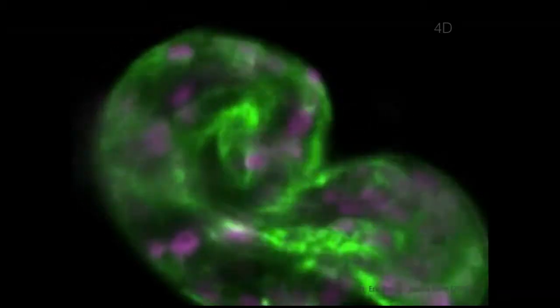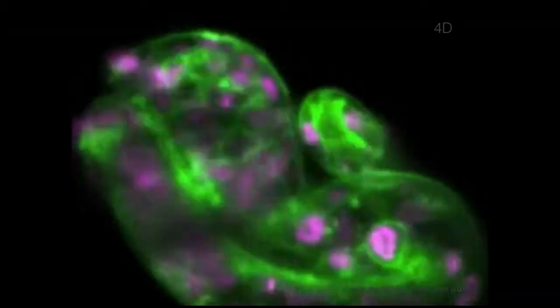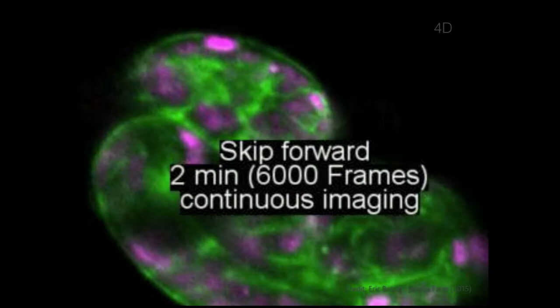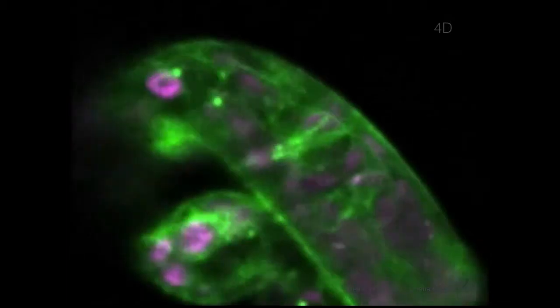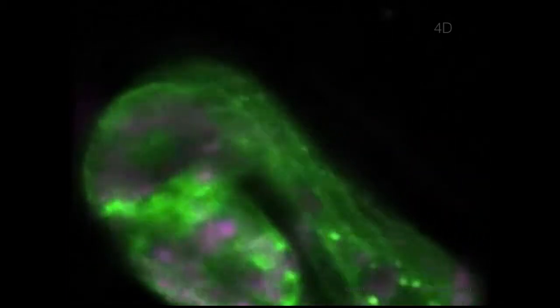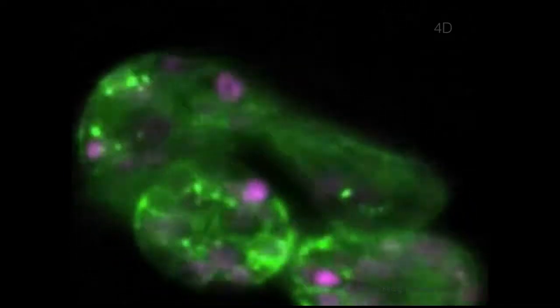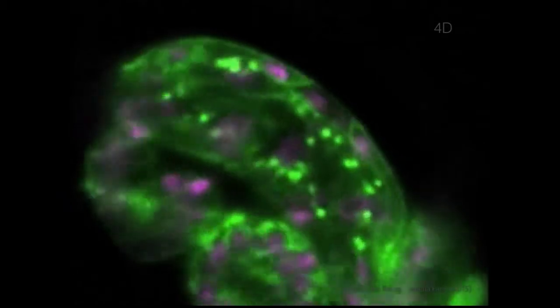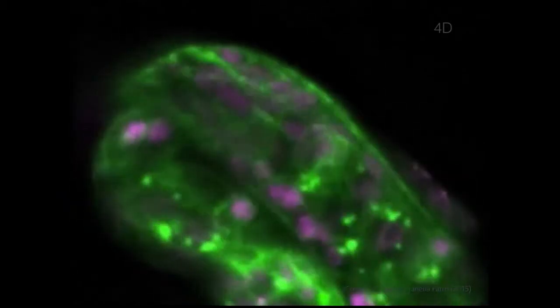So you can assume that you have an experiment with a tumor mass that is injected with green fluorescent proteins, and you can see this big mass in terms of fluorescence in the mice, and then you can start with the treatment and you can see this mass diminishing or increasing. So you can really track what's going on in living systems.